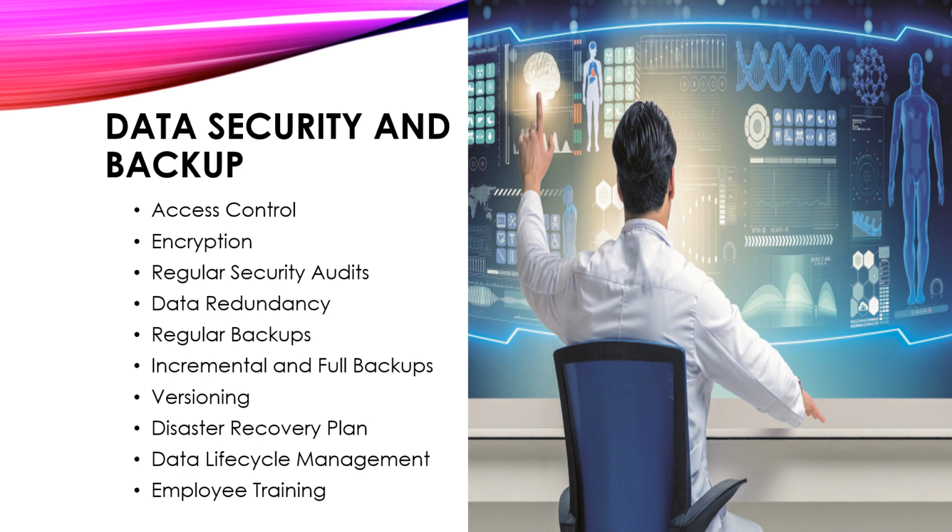Regular security audits. Conduct regular security audits and assessments to identify vulnerabilities and ensure compliance with data security standards and regulations such as the HIPAA. Take note, HIPAA stands for Health Insurance Portability and Accountability Act, or GDPR, which stands for General Data Protection Regulation.